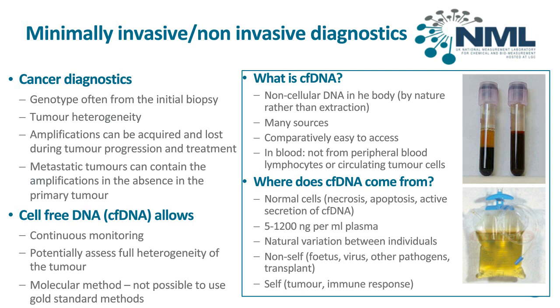It's relatively low, but there's a large range that you find in the blood plasma, and there's natural variation between individuals that will change over the course of a day, whether you're tired, stressed, or if you've just done exercise. And it comes either from yourself, so from your normal cells, or from, say, a tumor or an immune response, but also non-self. So the fetus will contribute to the cell-free DNA, or the virus or pathogens, or in fact an organ transplant.